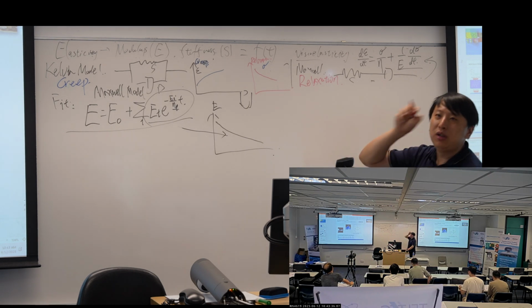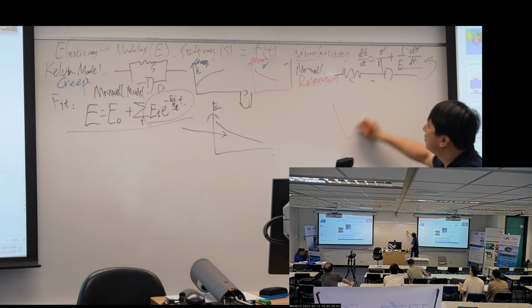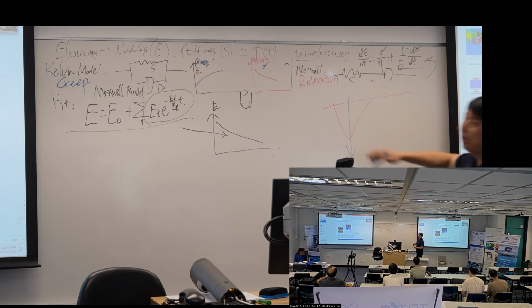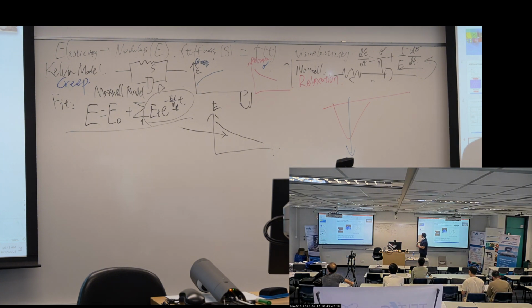The AFM, we know the shape of our probe is something like this, and then once we press down, we apply a force to press down. And since we have a piezo or scanner about here, we are really moving the scanner down. We are moving our Z piezo, our scanner down.